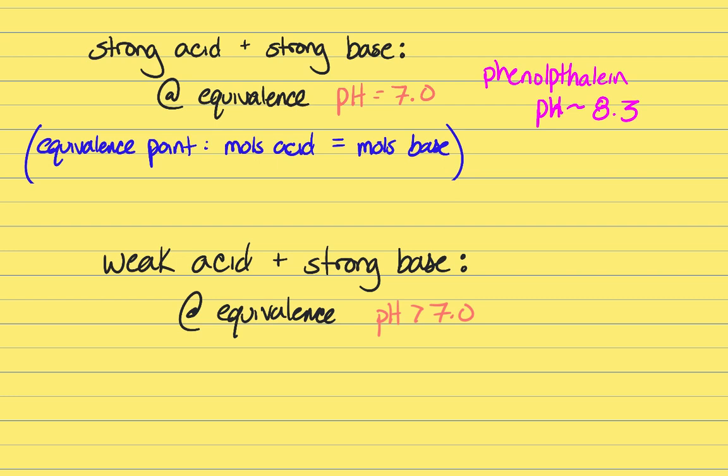How are we going to know that we're at equivalence? Well, this time around, we're not actually going to use an acid-base indicator. Instead, we're going to use a pH meter. So we're going to use a pH meter that connects to our laptops with the Vernier interface. And we're actually going to collect numerical pH data as part of our analysis this time.